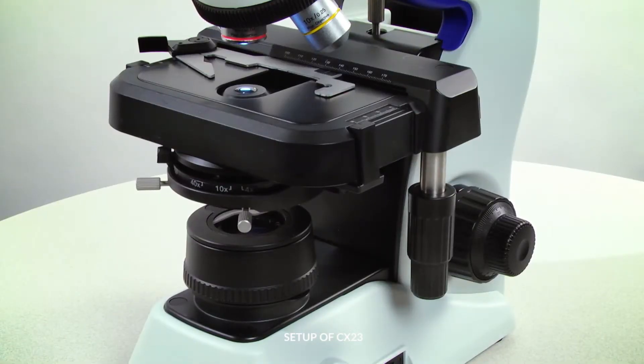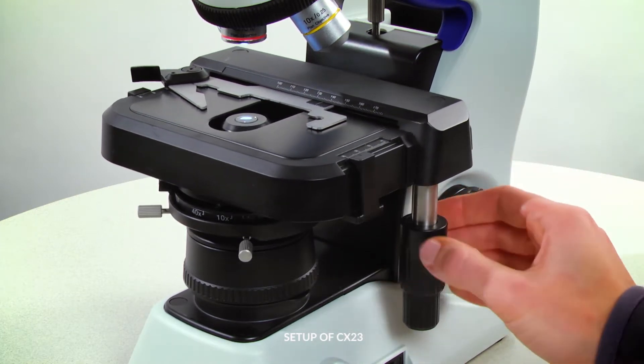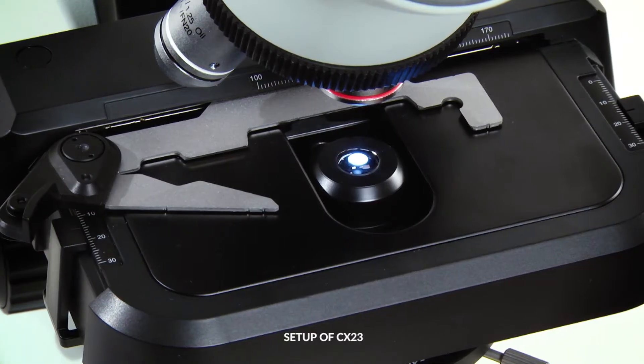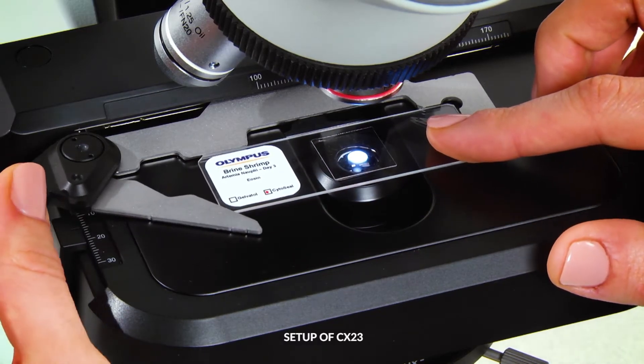Next, load a slide onto the stage. Ensure that the stage is low enough and that the objectives are out of the way to help prevent them from being damaged. Open the stage clip, place the slide into the clip, and gently close to secure the slide in place.